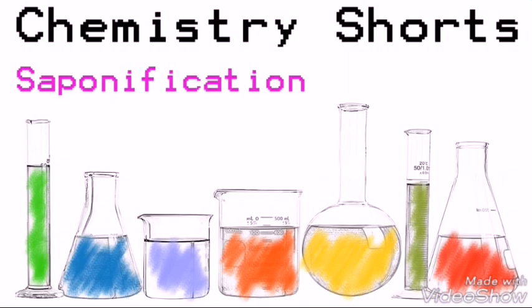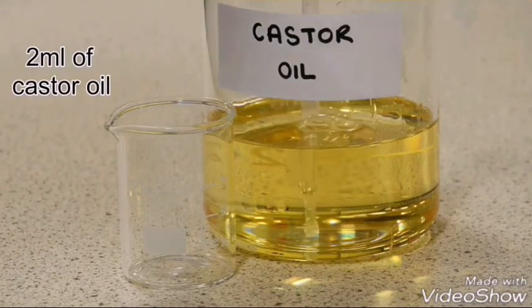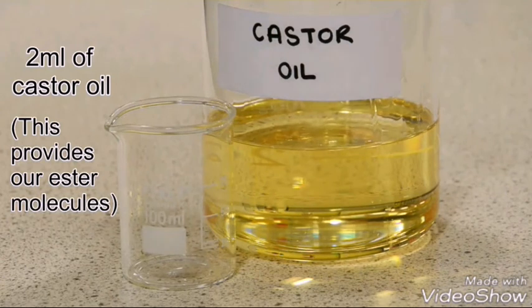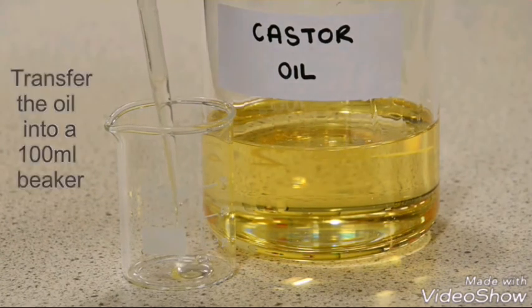a saponification reaction. That is the reaction between a fat or an ester and an alkali. So we're going to start with 2 milliliters of castor oil. That's going to be our fat or our ester. And I'm going to transfer that into a 100 milliliter beaker.